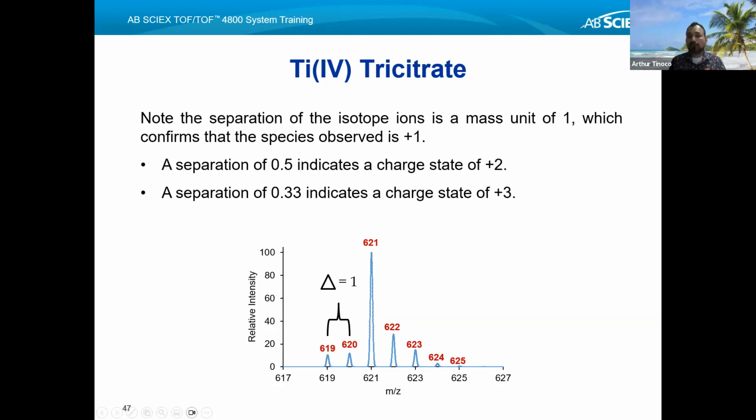It's very mathematical and is a very nice way to confirm that you have a certain charge state, and based on the isotopic distribution and the base peak, right, of that species, you can identify whether or not you have what you're interested in looking at.